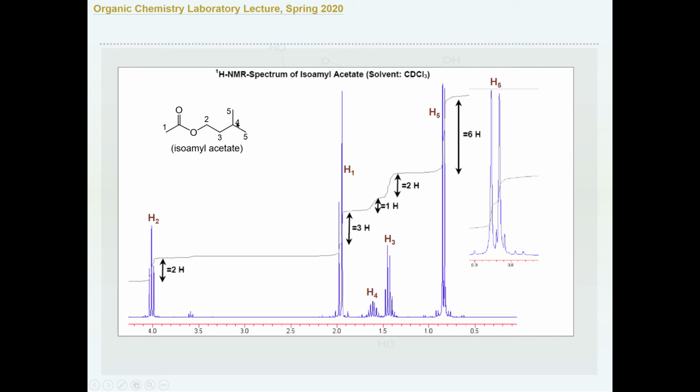And the most complicated will be this proton. This single proton is 1 here, but it's next to 6 protons in total, so it should be a heptet. But it's also next to two protons here, which should be a triplet. So this single proton will split into a heptet and then times triplet. That's why it becomes so broad, a hump here and many multiple pieces.